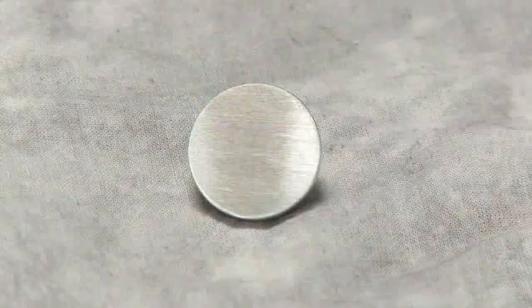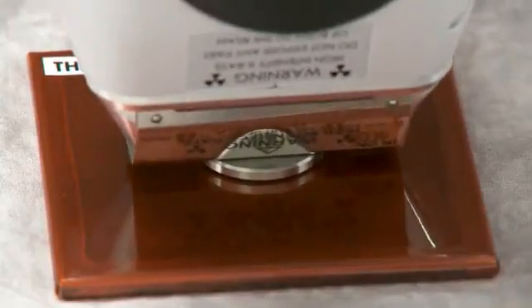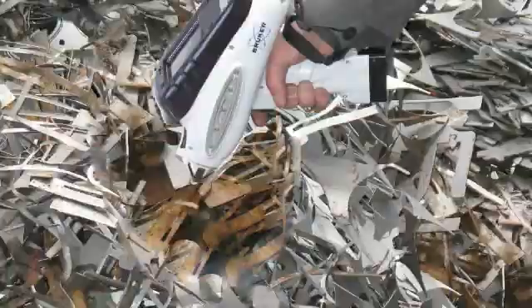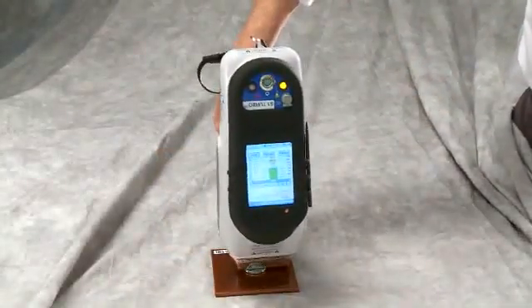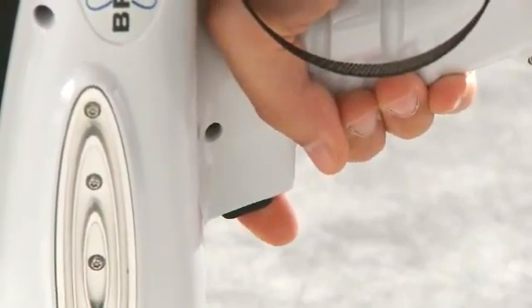When making a measurement with the S1 analyzer, the surface of the sample should be flat, smooth, and clean, and completely cover the window. If there is paint or corrosion on the surface of the sample, this will cause erroneous readings, and a curved surface or other sample irregularities will lower the accuracy of the readings. In order to make a measurement, simply place the analyzer on the sample, pull the trigger, and hold until the measurement is complete and then release.